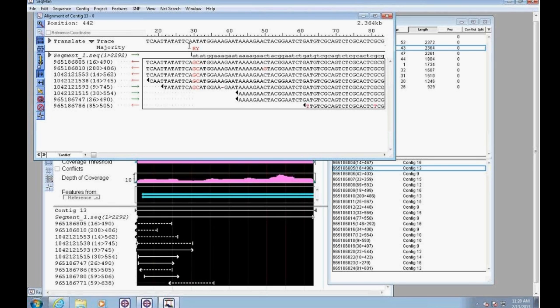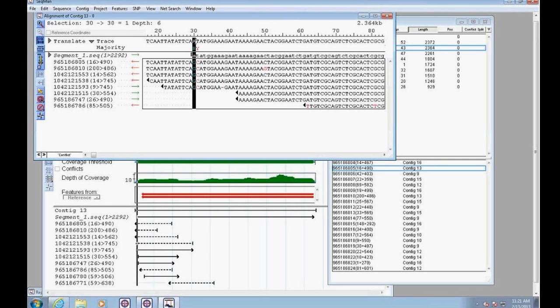This is especially true when there are cases of heterozygosity in your reads. For example, the actual call was an R, but somewhere it called NA based on some of the trace data. I'll go into that in a later assembly. I'll show you the trace data and show how that decision is made.